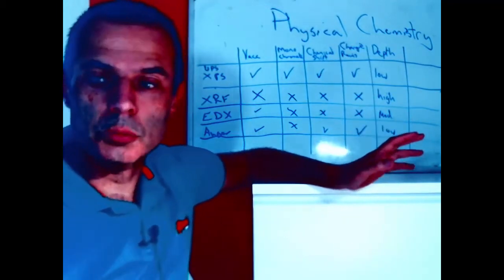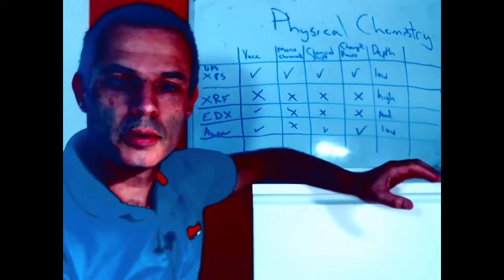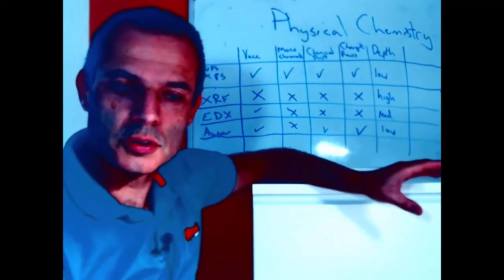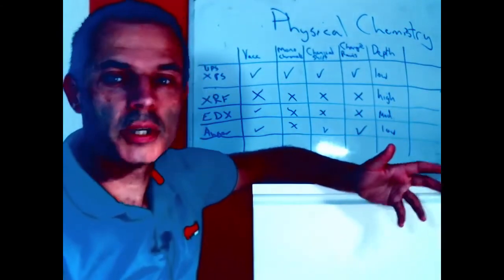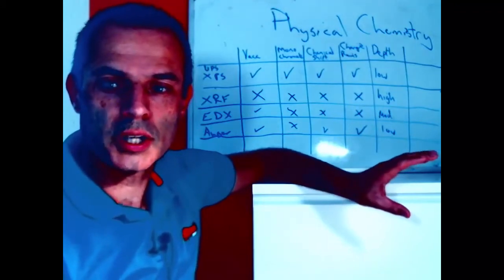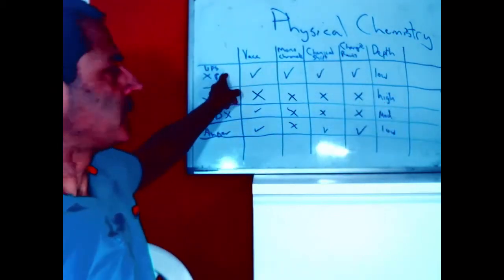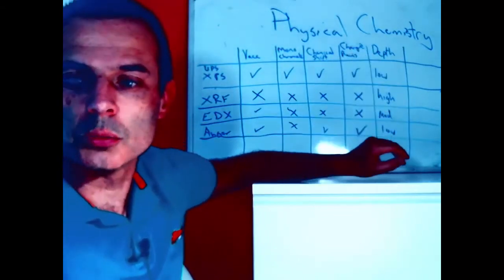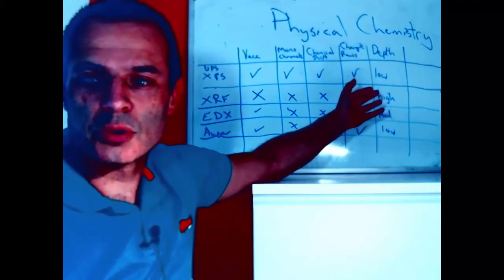This is again a good and bad thing. So in XPS we have a very low penetration depth. It's of the order of tens of nanometers. So we can get in below the surface, we can measure stuff that isn't just on the surface, but if we take a metal, for example, we will only see metal oxide unless it's got a very thin oxide layer. So it's very low because the electrons coming out don't have the energy to penetrate out. The X-ray can go in as deep as we like, but it doesn't do us any good if the electrons can't get out.